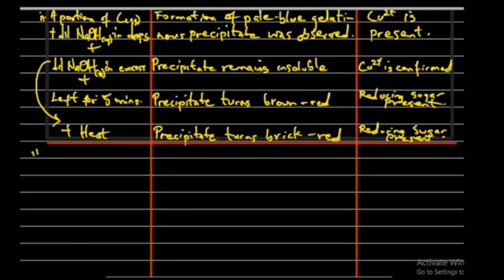We also tested a portion of C, which is already in aqueous form, plus dilute aqueous ammonia in drops.